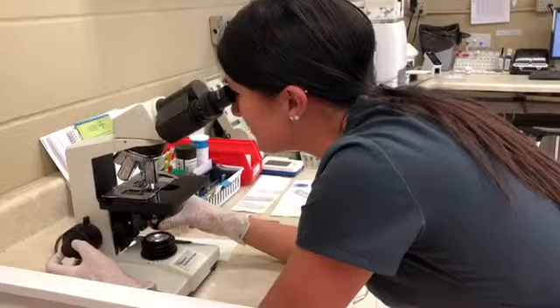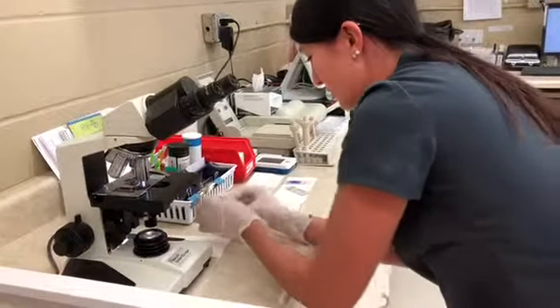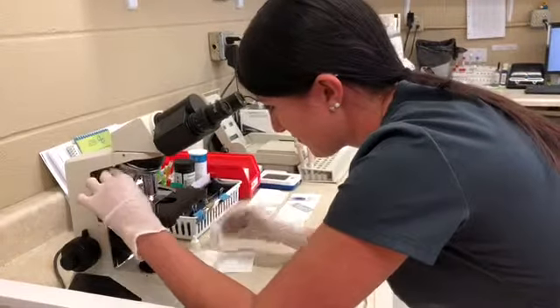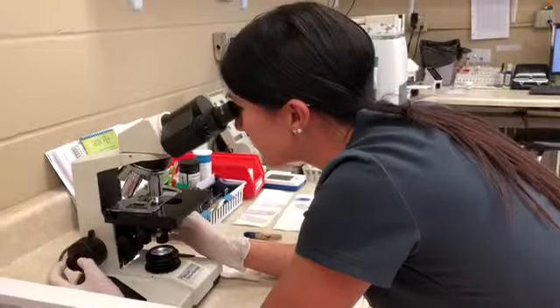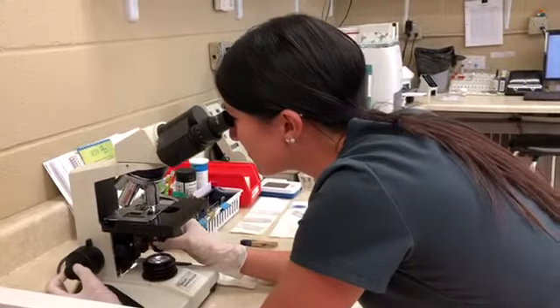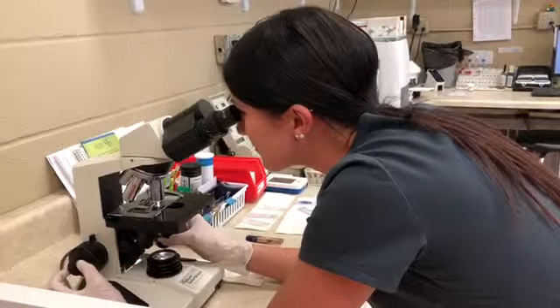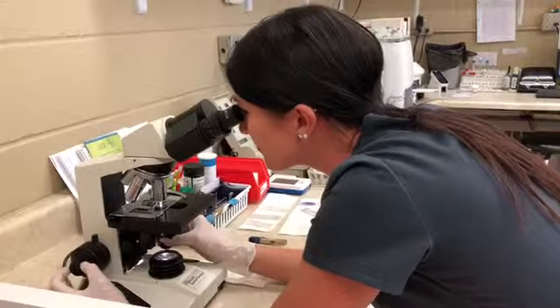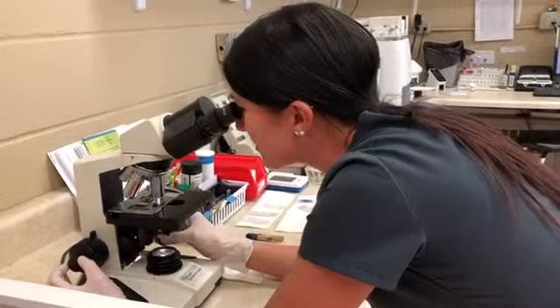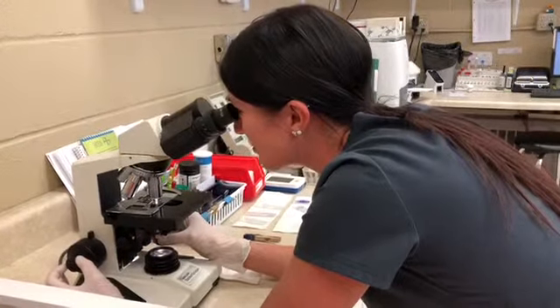Let's take a look here. This is a good field. I'm going to move up to 100x, which is the oil immersion power, and get that into focus. I am seeing some cells in here, and in just a moment I'll take you over to the computer and show you exactly what I'm seeing.